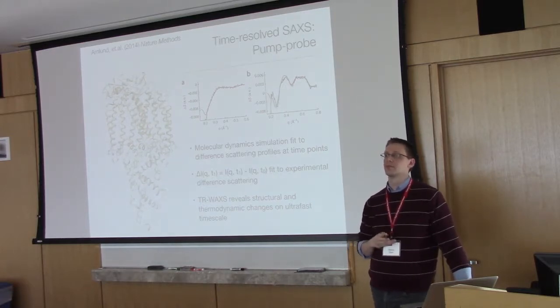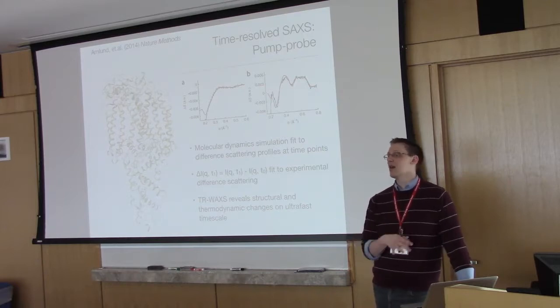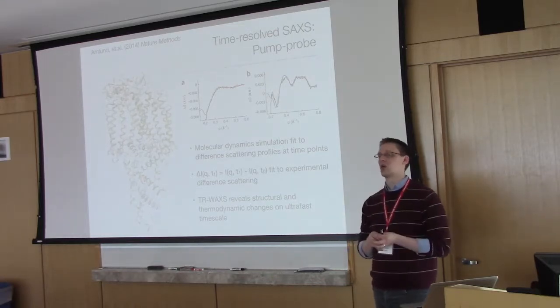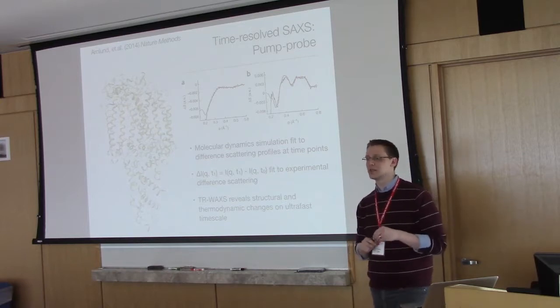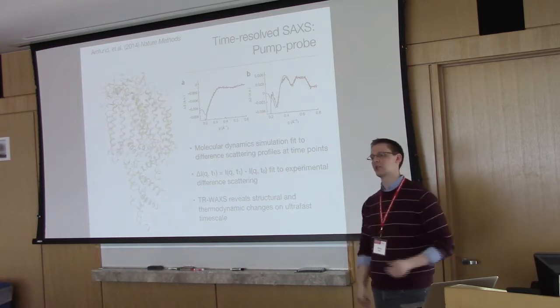Okay. Is there a term like occupancy in ab initio modeling to take into account the conformational variation? So this is where ensemble modeling comes in. Ensemble modeling is effectively that. There isn't an ensemble version of bead modeling, but ensemble modeling a lot of times can have any sequence to it. So you can unfold it, and in that sense it can be ab initio without the need for structures. But it gets rough in terms of how accurate that is, because there's a lot of constraints. But not in terms of just bead modeling. There's no ensemble version of bead modeling.